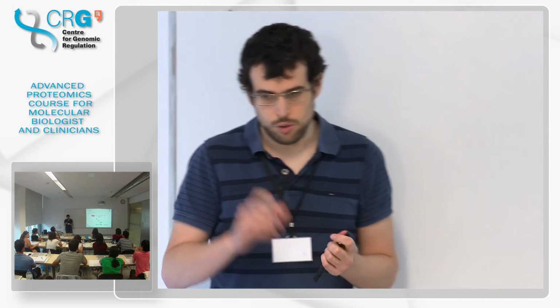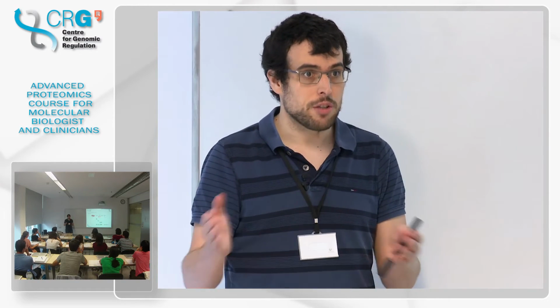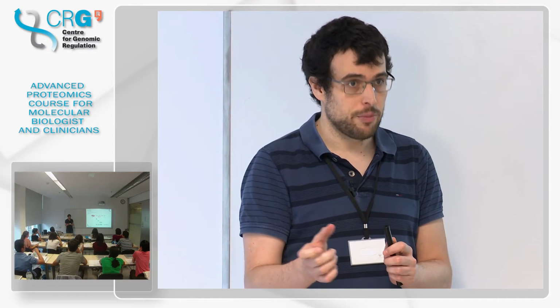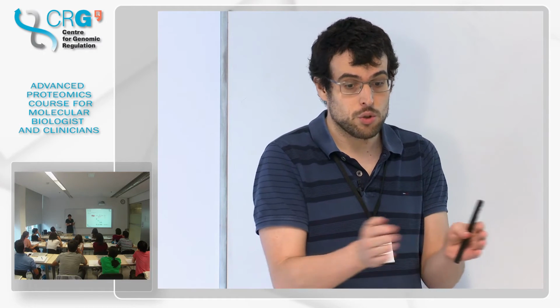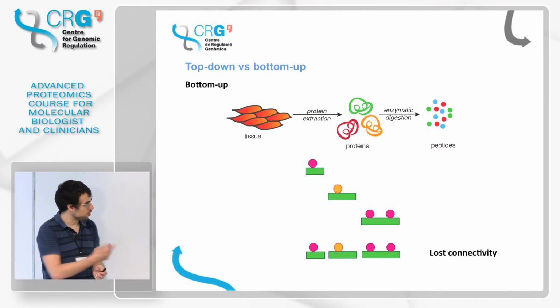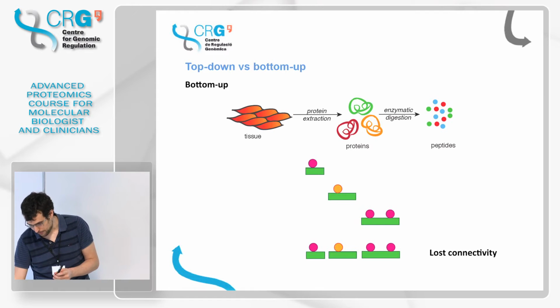Yeah, well, tomorrow we have a dedicated session on quantitation, but the important thing is that peptides, as you said, can be shared between different proteins. We all know that there are some domains that are very frequent in several proteins, and this can produce shared peptides. So for quantitation, for instance, we can use everything when we do top-down in a purified protein. When we do bottom-up approaches, we have to use peptides that are unique for that particular protein. Okay, and we will see this in the quantitation approach.